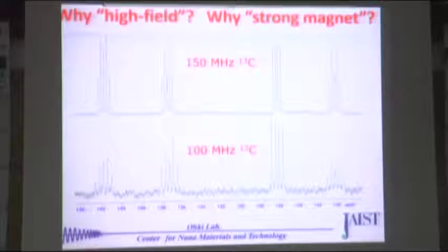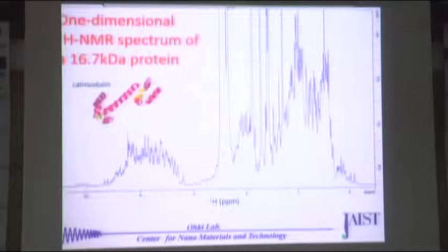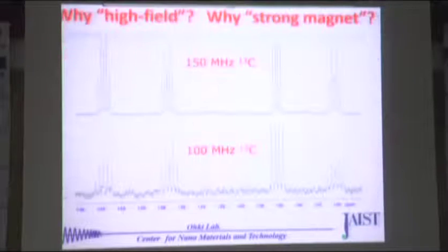Which is better? Sorry, which is better? This one is much better than this one: higher resolution, higher sensitivity, and a nice baseline. Okay.